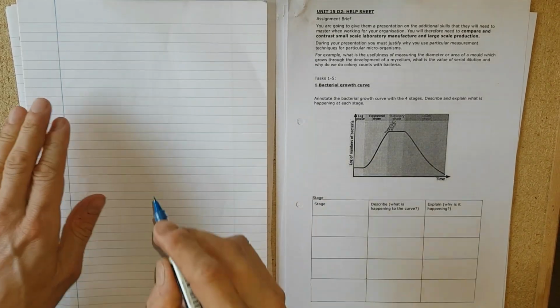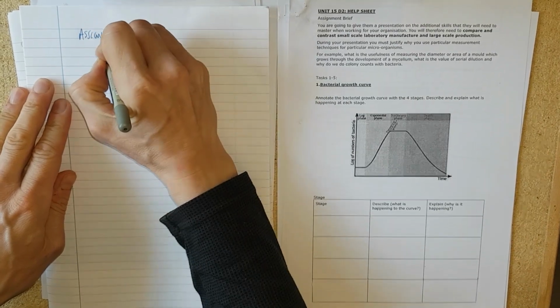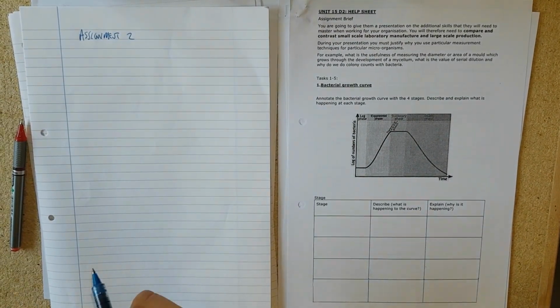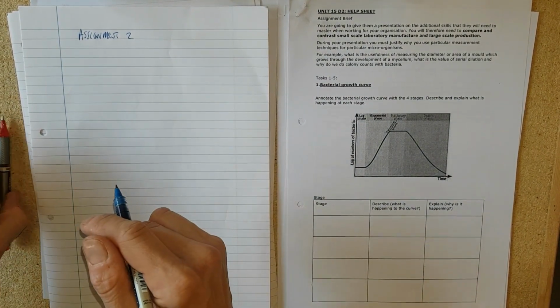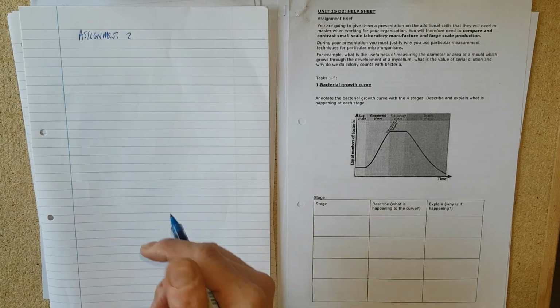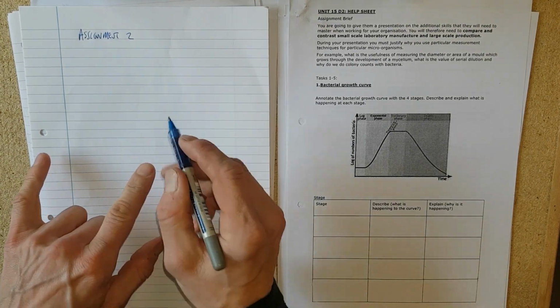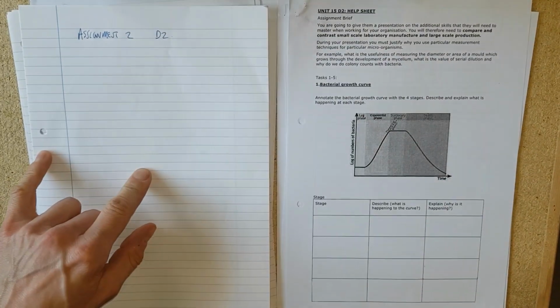This is a run through of assignment 2, where we did pour plates and streak plates and things like that, and for the merit there was explaining aseptic technique and culture medium and so on. This is D2, which is comparing your experiments really against what they do in industry. And this is page 1.